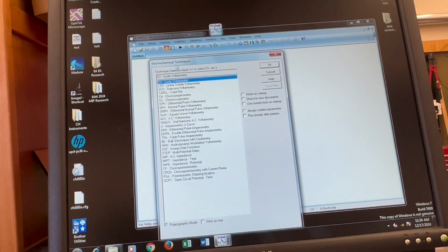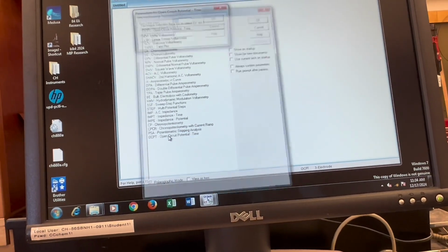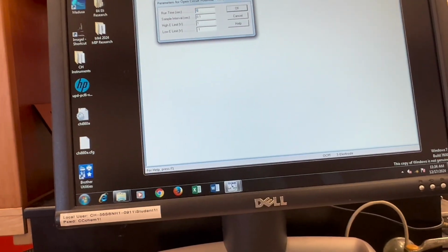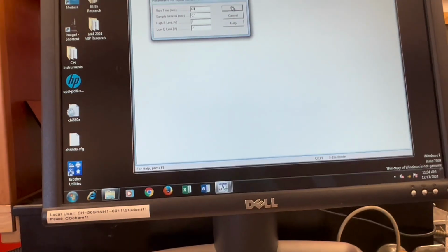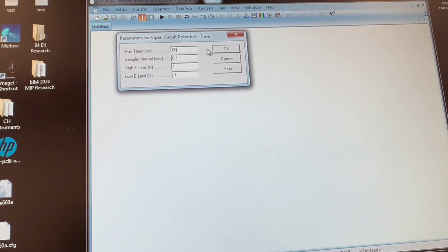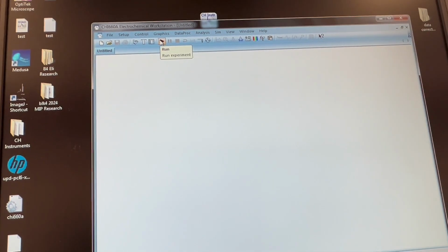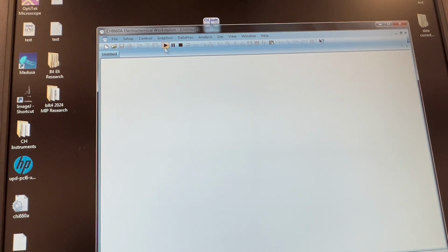And then we open the CH Instruments software. Click the little T for setup. We choose OCPT first, and we give it 60 seconds. And then click OK. And make sure to click the little triangle here to let it run.